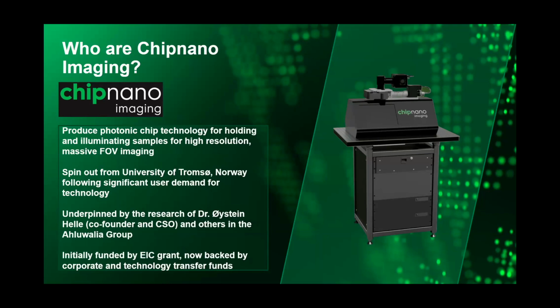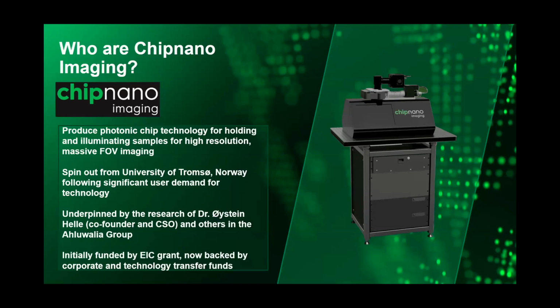And what Oystein and his team and others in the Ahluwalia group at the university did was they originally applied for an EIC grant, but now they're also backed by corporate and technology transfer funds. What you can see on the right-hand side there is parts of an OpenStand that's then integrated into a much larger system that they themselves have taken more responsibility for developing. But the core motorization elements we've assisted them with through OpenStand.